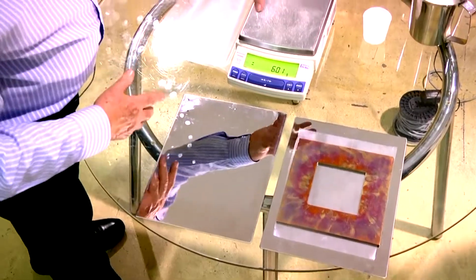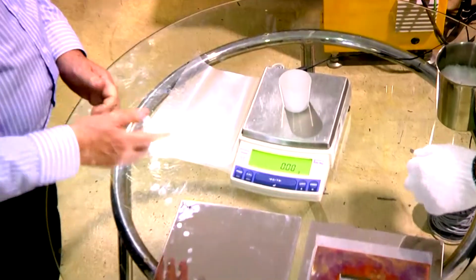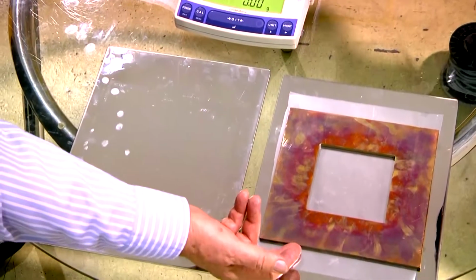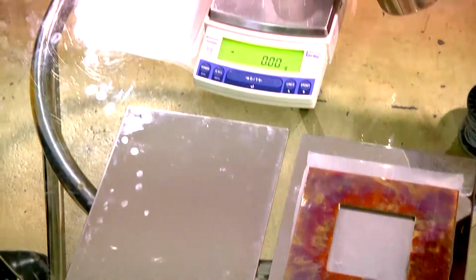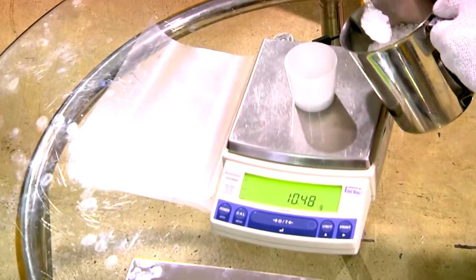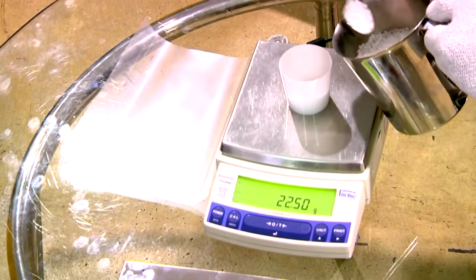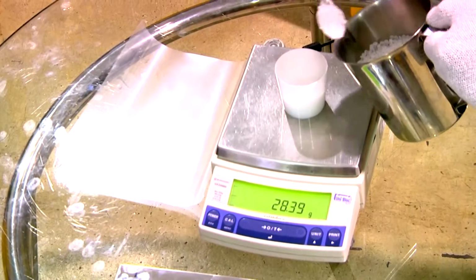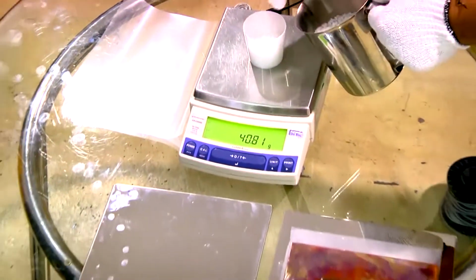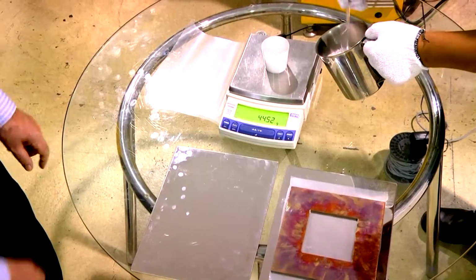So we will weigh out the pellets, and in this case, for this size mold, which is 5 millimeters thick, we weigh out 43 grams. This is LLDPE. The actual molding works out to be actually 41 grams after trimming off the flash.